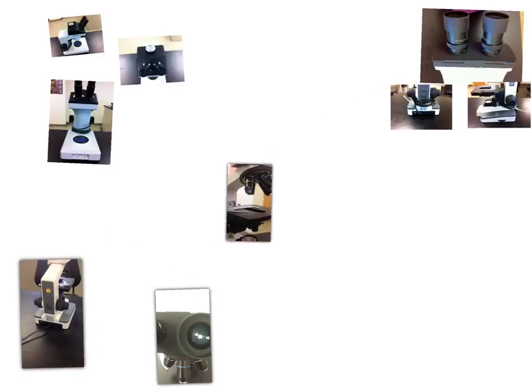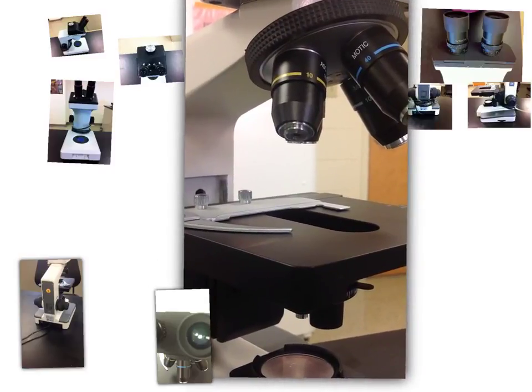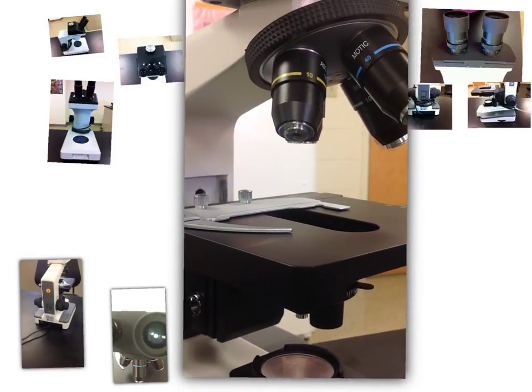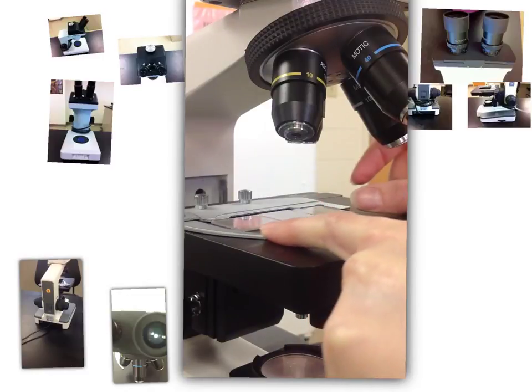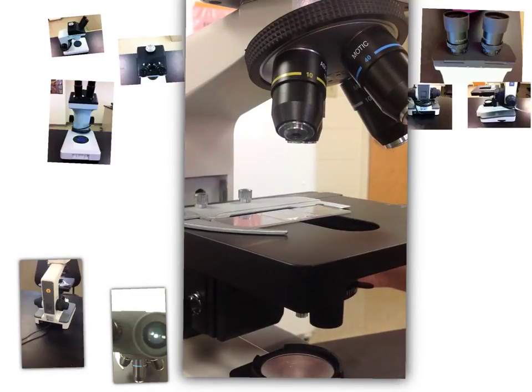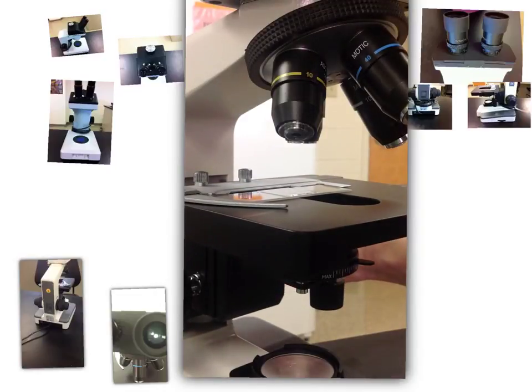Shrink this guy down a bit over here. So this is how we are going to put a slide onto the actual microscope. If you notice your working distance, and that's the distance basically from here to here. So from your slide to your objective, it is going to get much smaller than the working distance from your dissecting scope. So you're going to put the slide on. That little clip is going to retract. There you go, slide it, make sure it's nice and snug. And you're going to use your coarse adjustment and you're going to bring it all the way up.